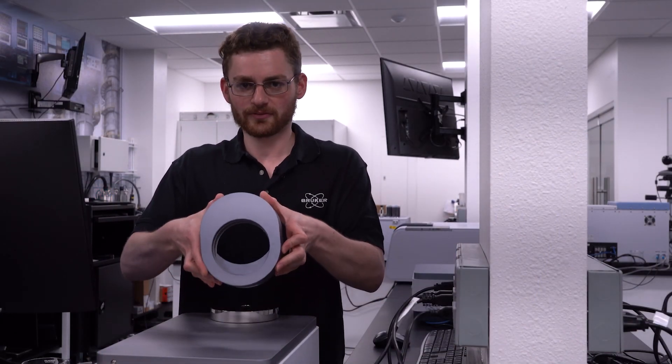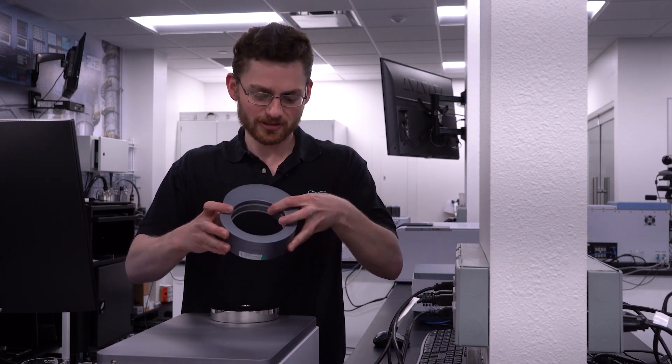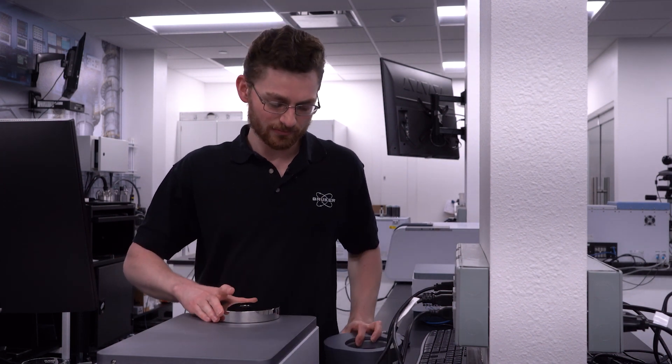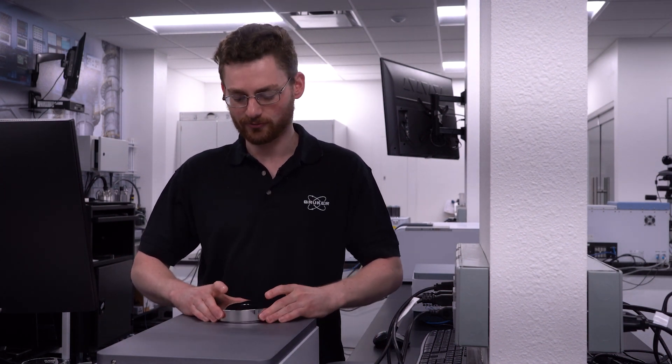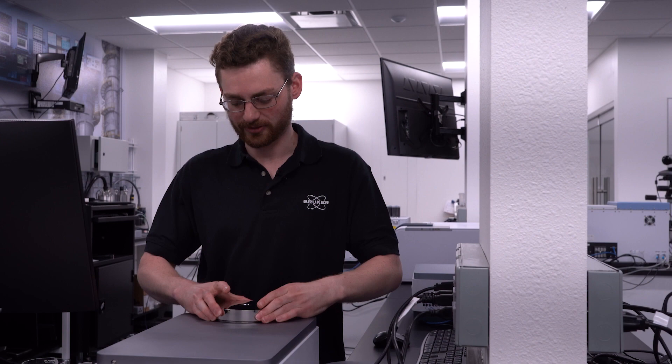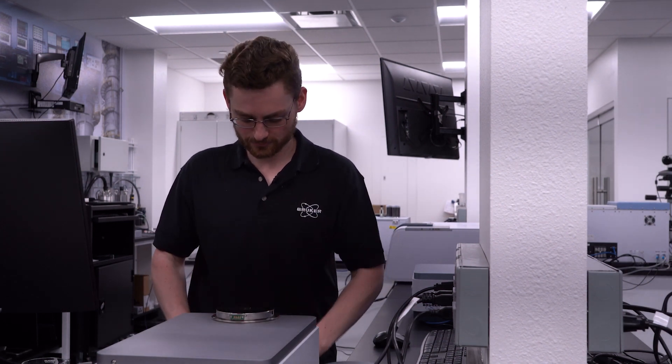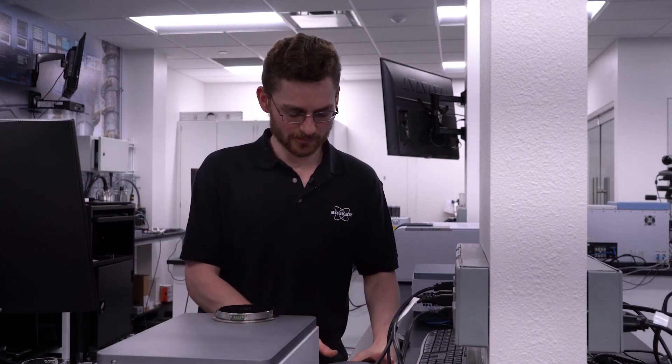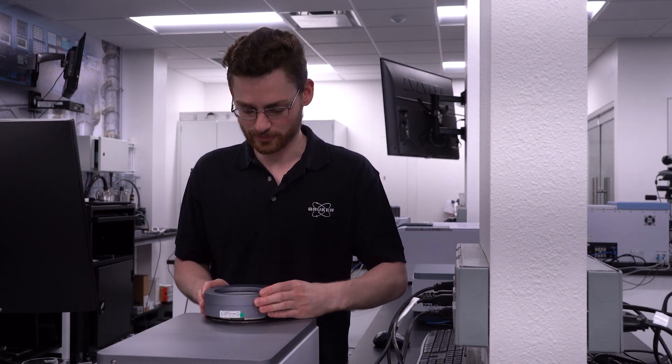Here we have the 97 millimeter cup. It's really easy to install. All you have to do is remove your other accessory and then simply put it on.